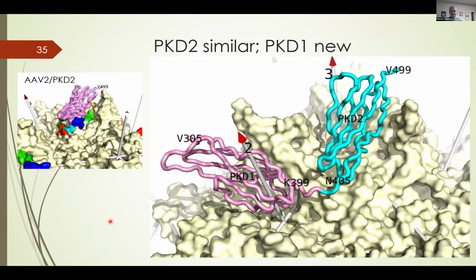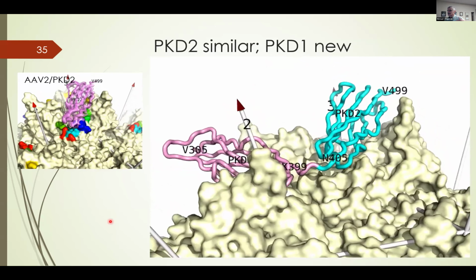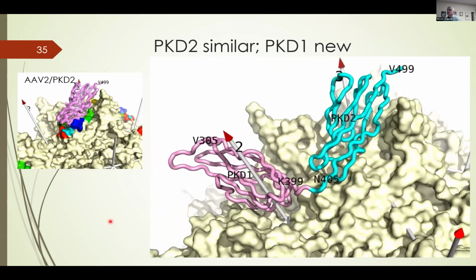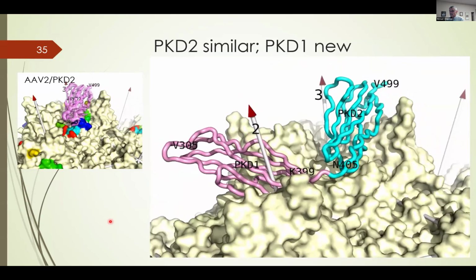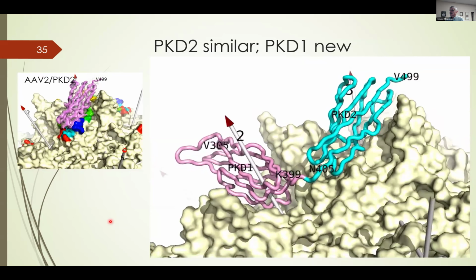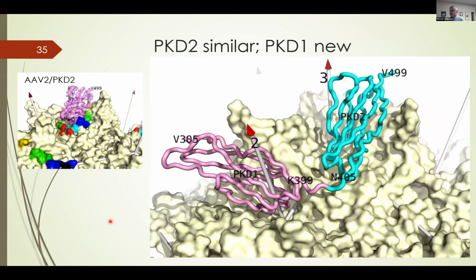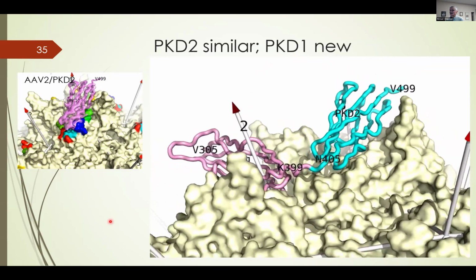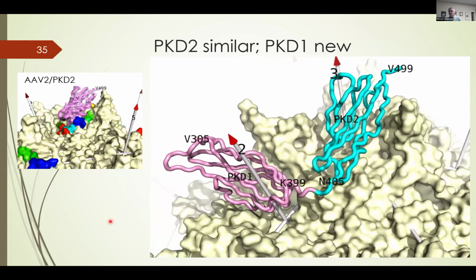Yes, so we've got a sort of unorthodox way that we will, using a model that we've refined against one of the maps, scale each of the maps to that model, and that accounts for both a gain aspect and an offset that will be appropriate for the region that we're looking at, and according to the refined B factors and so on that are all in the model.